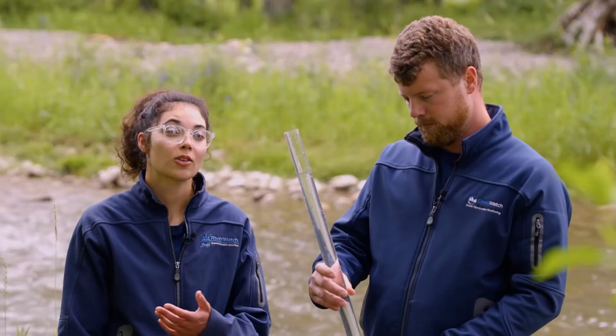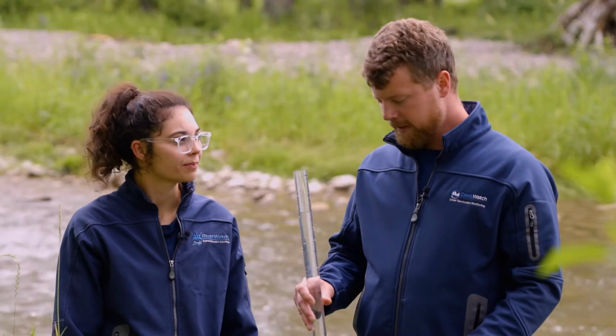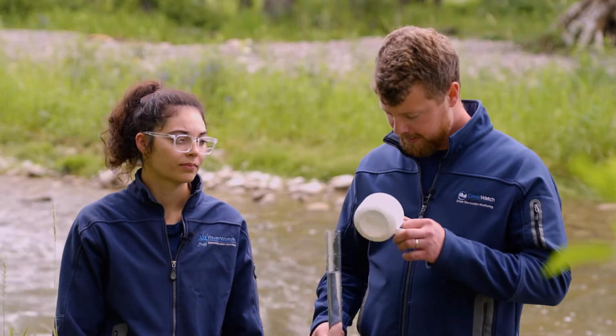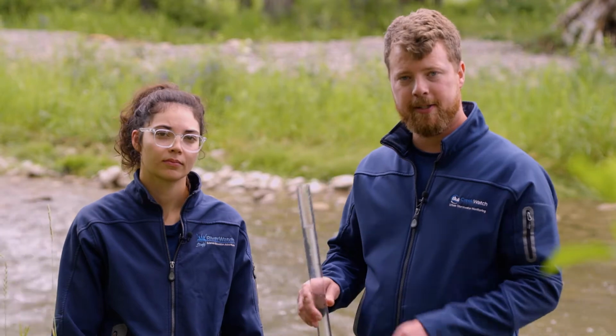So there's how you measure turbidity in your creeks. Yeah, real simple. We have a turbidity tube, a measuring cup here, and we just record our units in NTUs.